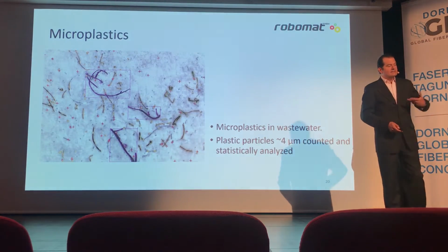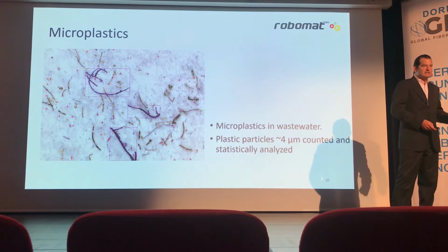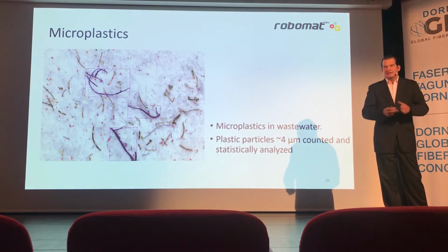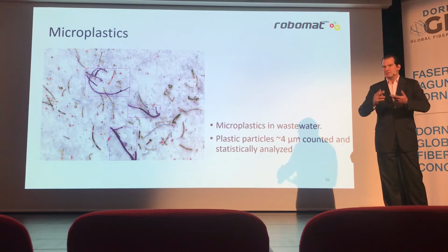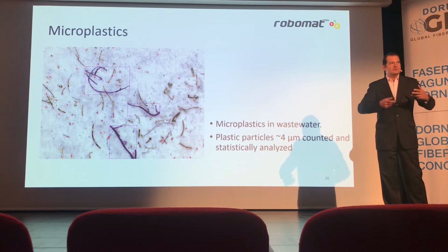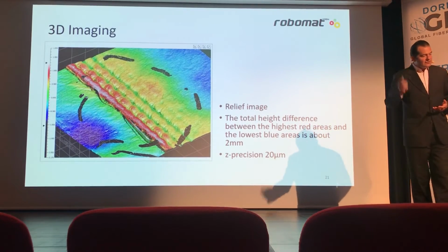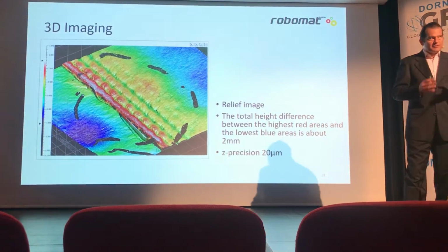We have done analysis of microplastics in wastewater. Again, with the analytics of the optical recognition, we can count, we can give sizes, we can give areas, and then give you some new data of what you're looking for. Extremely interesting if you combine this with 3D imaging.